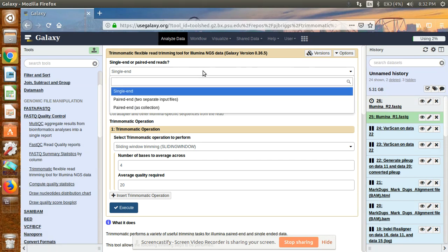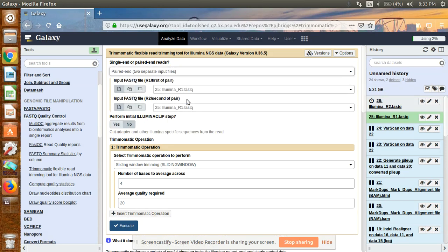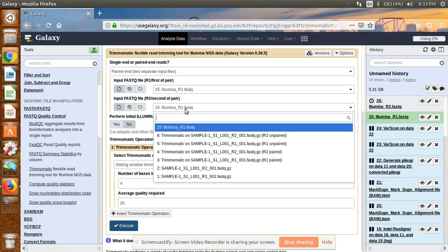After clicking Trimmomatic, you have to choose what type of data you have. In my case it is paired-end sequencing, so select that option. For paired-end you need to provide a forward sequence and a reverse sequence. In my case the forward sequence is R1 and the reverse is R2 — select R2 for the reverse input.